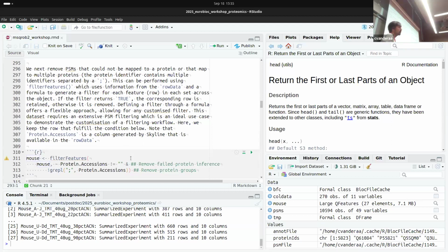In fact, in this workflow, we recommend it. Like the summarization step, the function will take into consideration that there are unique peptides, but also shared ones. I don't show it here, but there is a function in msqrob2 that will allow you to simplify this, because it's true you can have some peptides that map to one protein and other peptides that map to a group of proteins, but that first protein can be contained in groups of proteins. There is a function in msqrob2 that allows you to simplify these issues. Indeed, that's possible. Again, I didn't demonstrate it, but good question.